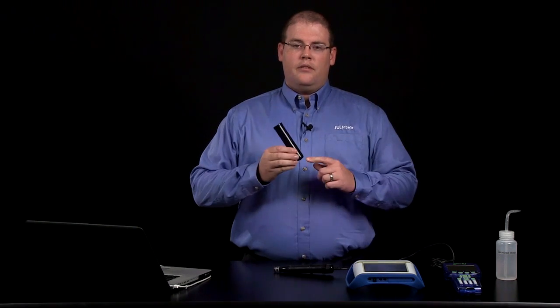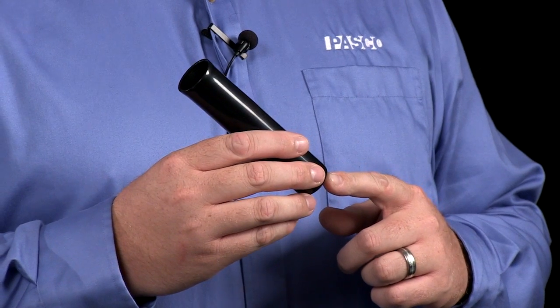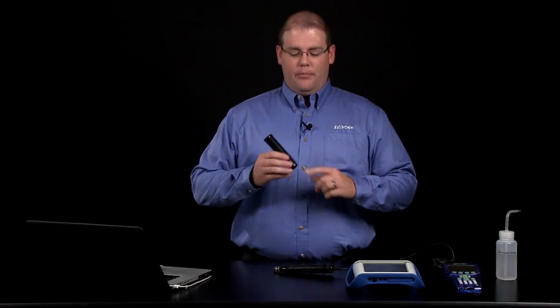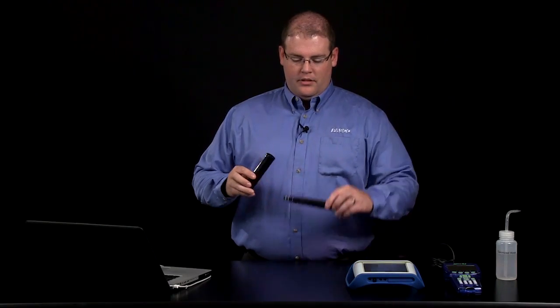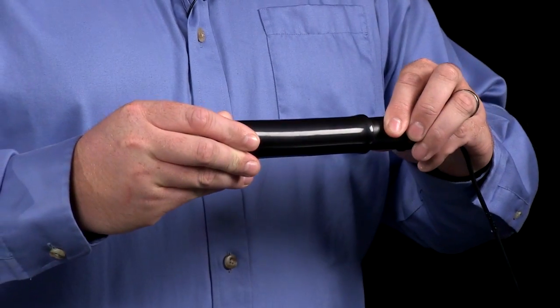To calibrate the sensor, make sure the sponge at the bottom of the storage and calibration sleeve is damp, place the sensor into the sleeve, and wait 60 seconds before proceeding with the calibration.